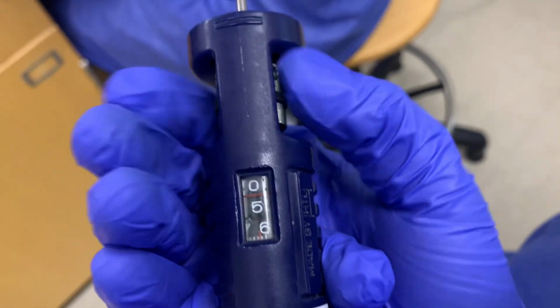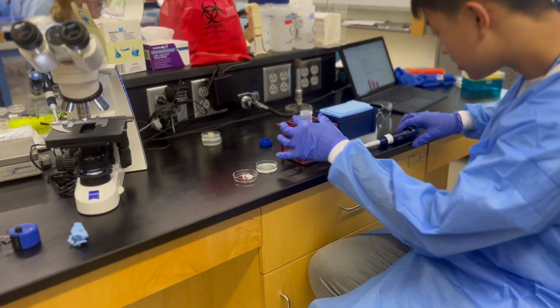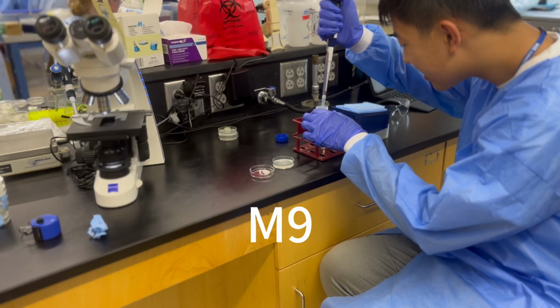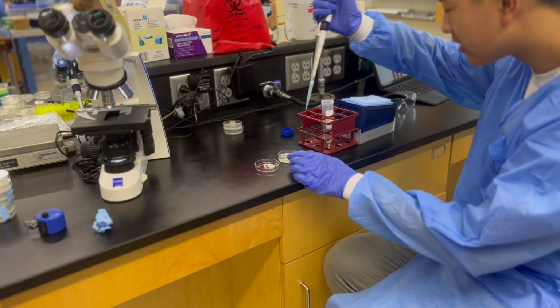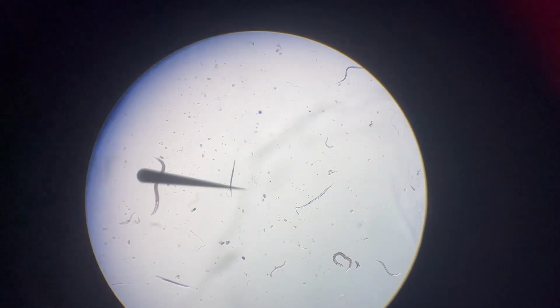Moving on to the thrashing movement, we begin by setting the micropipette to the correct scale, 500 microliters, which is also half a milliliter. Basically, thrashing behavior only occurs when the worms are actually submerged in water, so we have to pipette a solution called M9 into the plates, which is basically just water and salt mixed together to clean the worms, before viewing the worm's actual behavior. Overall, the results showed that ALS worms thrashed significantly less compared to the wild-type and EAT4 worms, which in general correlated excessive glutamate levels with a degree of disabled motor functionality.